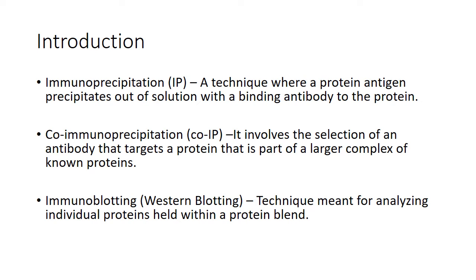This works because the proteins involved in the complex bind to each other very tightly, making it possible to pull multiple other members of the complex out of a solution. The antibody latches onto one member.